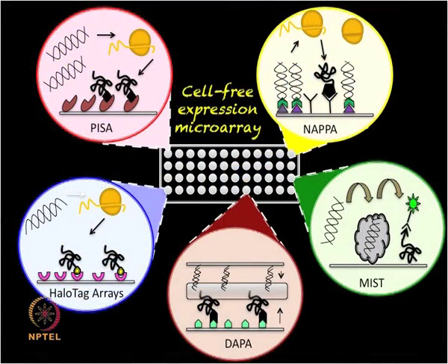We talked about protein in situ arrays, halo tag arrays, DNA arrays to protein arrays, multiple spotting technique, as well as nucleic acid programmable protein arrays.